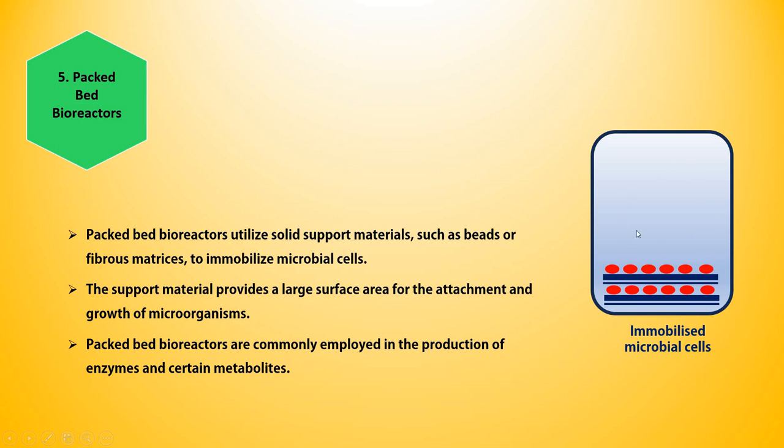So in the media, these microbial cells can produce the products, and it will release them, and it will be easy to recover the products from the bioreactor.